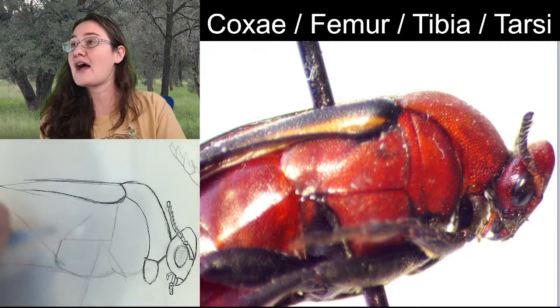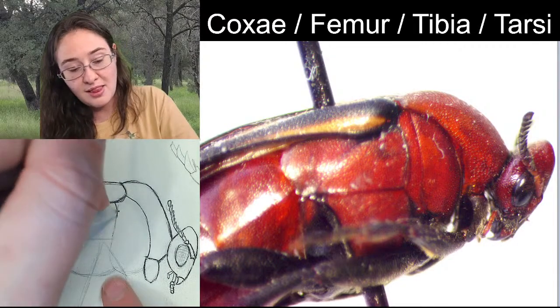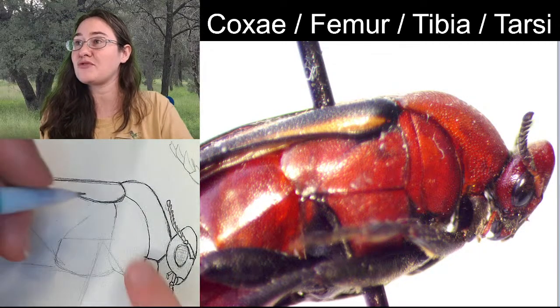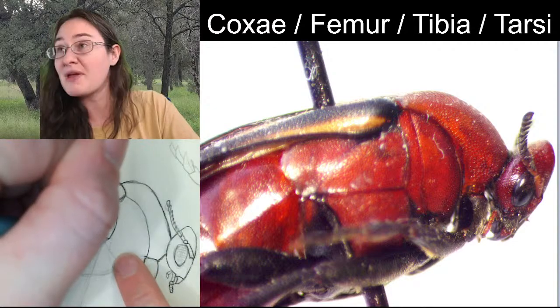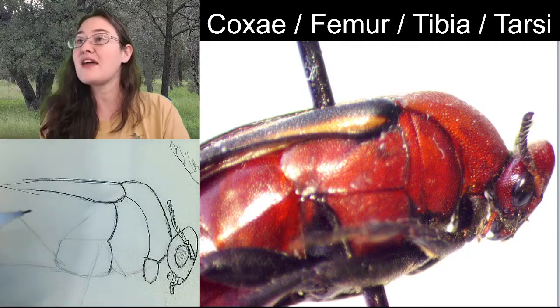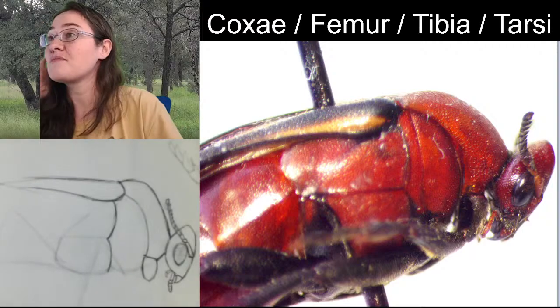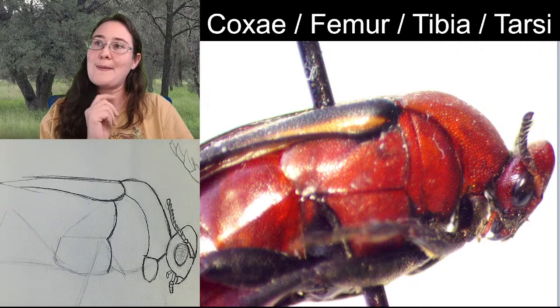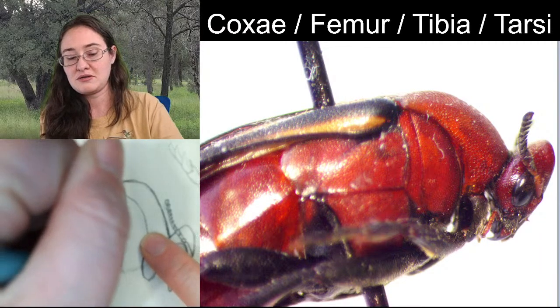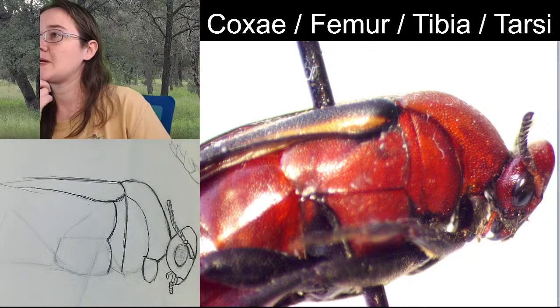Very good. Now, moving down from our elytra here, instead of this line being straight like we had originally sketched it, I'm just going to make it into an arch that meets that center line. Like that. And something that I hadn't noticed from before was this medial suture, this line here.